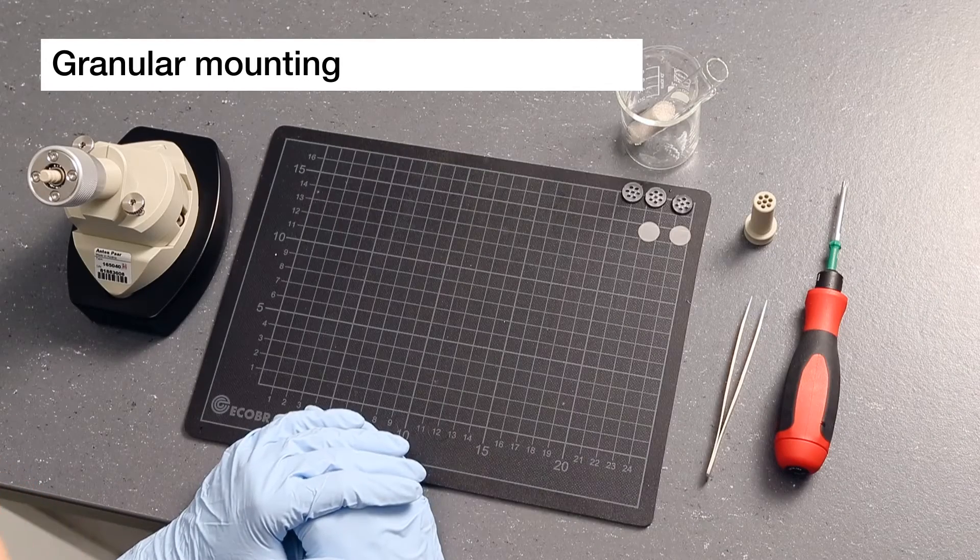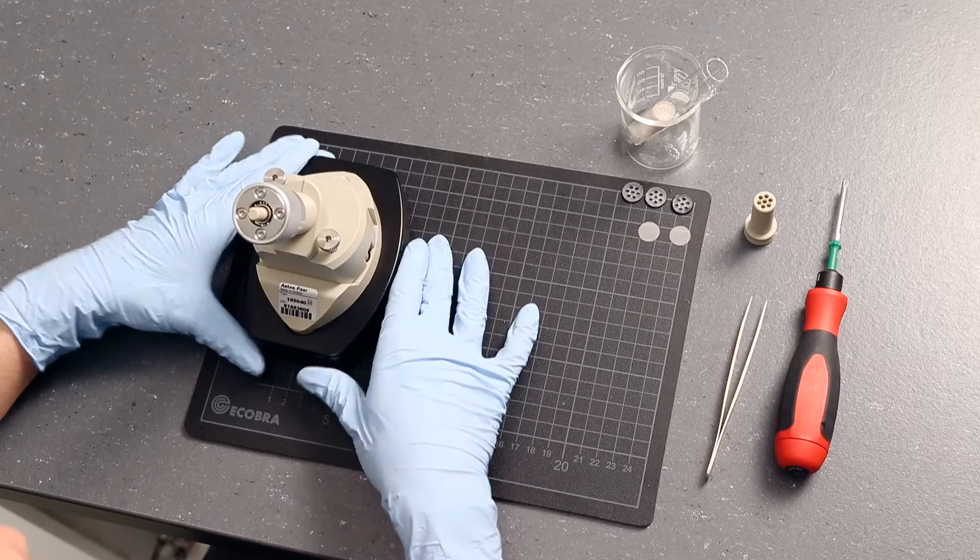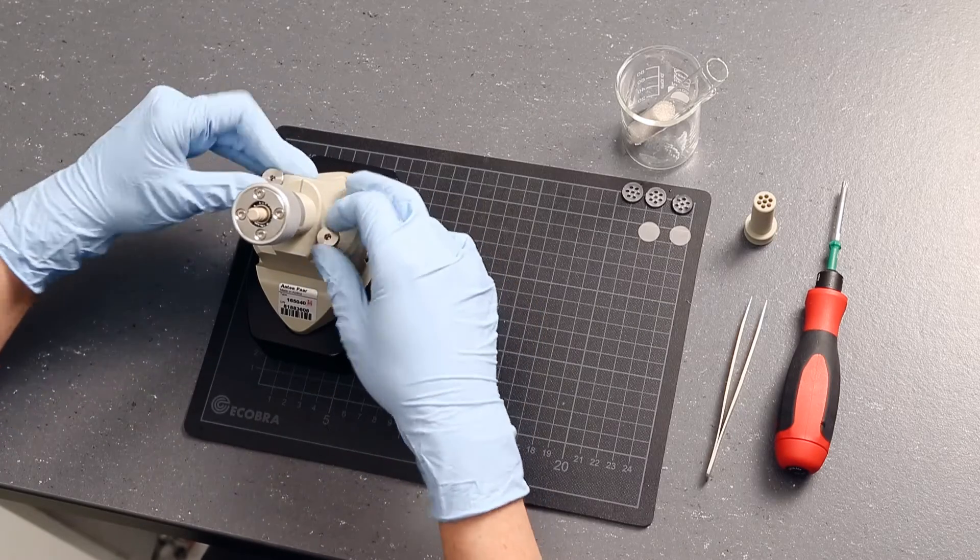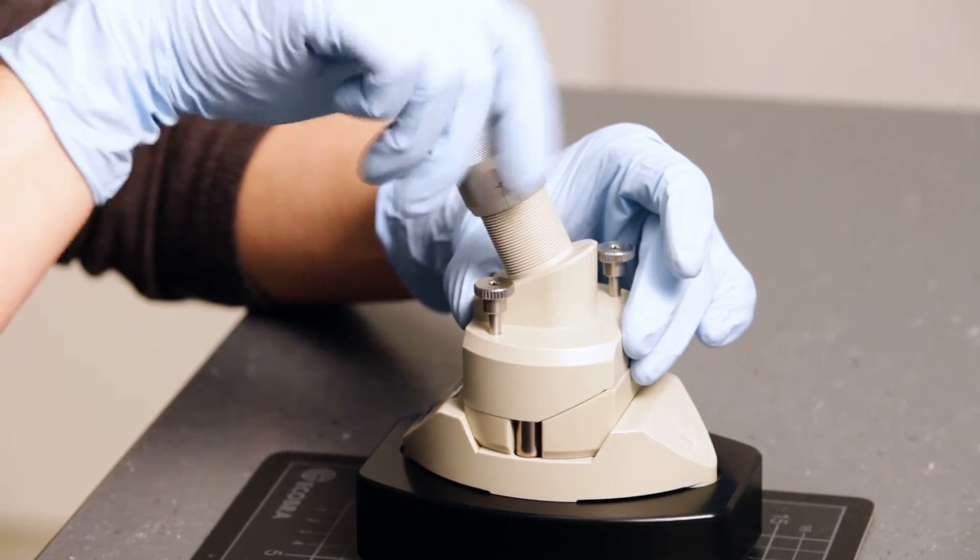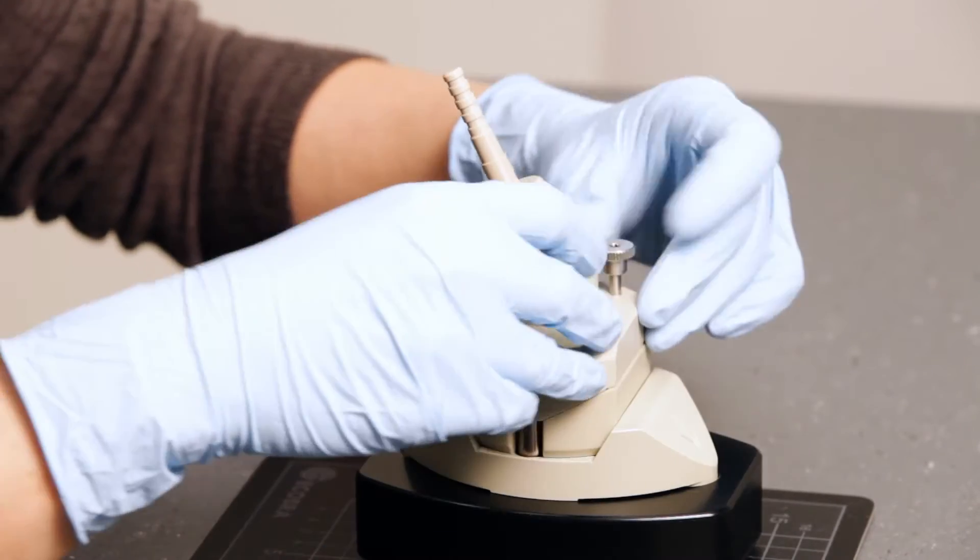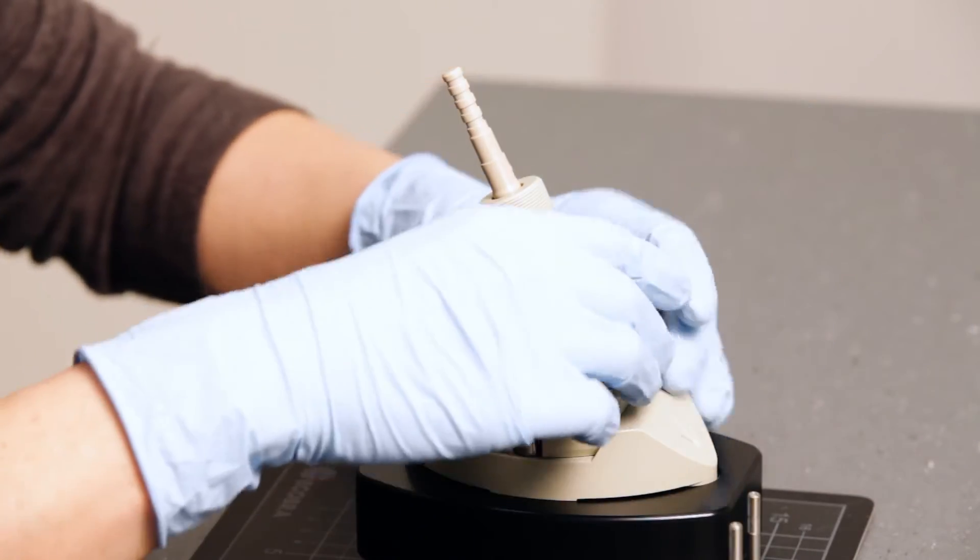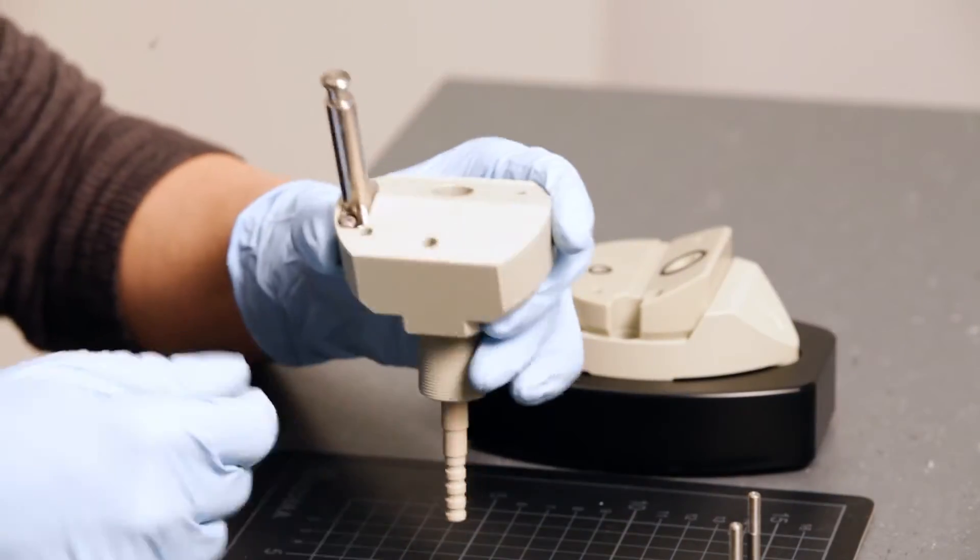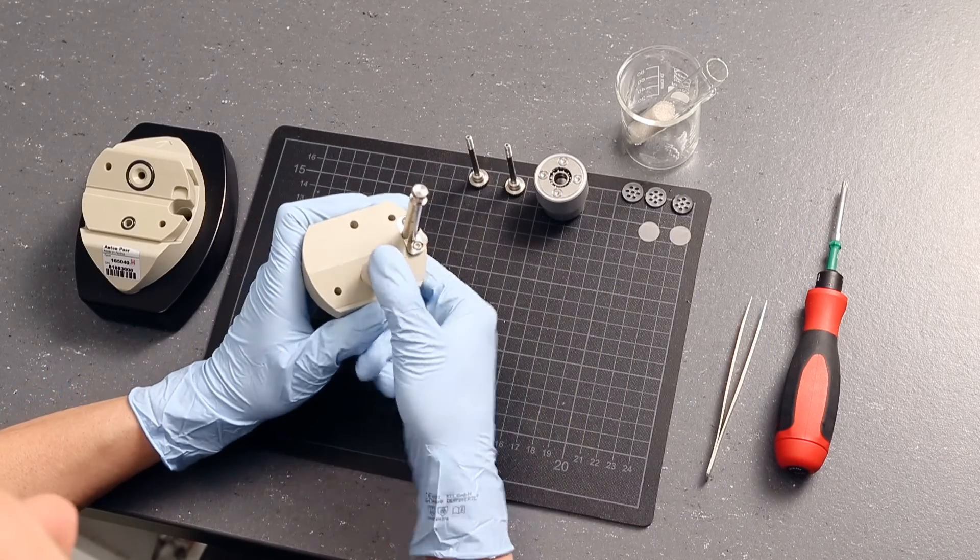To mount a granular sample, you need to take a slightly different approach. Disassemble the cylindrical cell to access the sample compartment. Use the mounting rod to push the shaft to the bottom.